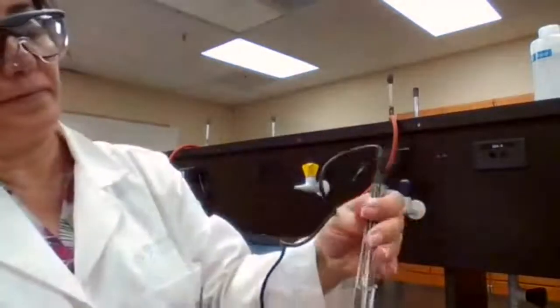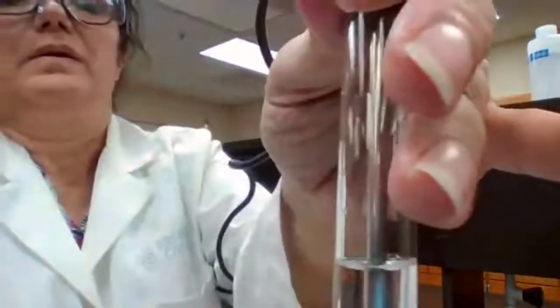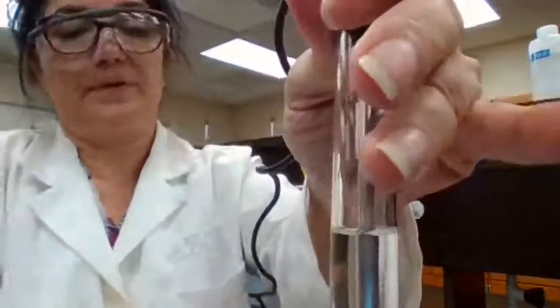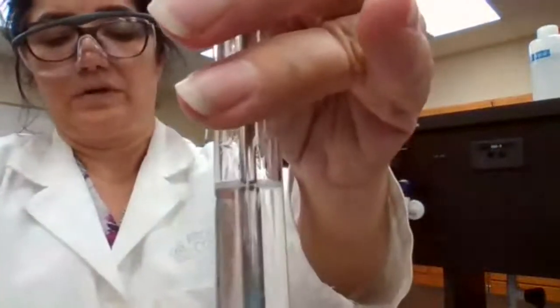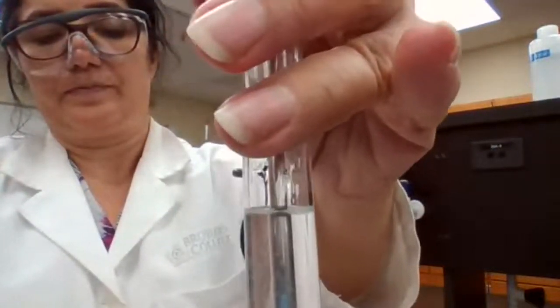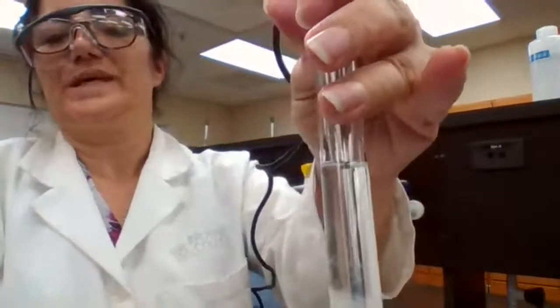Temperature is 65. 65. Record temperature 65.2. 65.2. Do you see crystals coming out? Do you see it turning cloudy? Okay, you can take a screenshot, or at least observe it. So 65.2. Yes, for test tube 3.